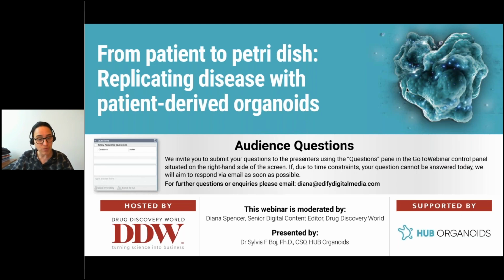Then when we perform our experiments, either to assess their activity or their response to certain compounds, and maybe use this model repeatedly in different projects, using different combinations of compounds, but always having a couple of control compounds that are always evaluated, we don't expand the organoids more than these 5-6 passages you need to have sufficient material to execute the experiment. And following this procedure, you don't see a change in the response to chemotherapies.